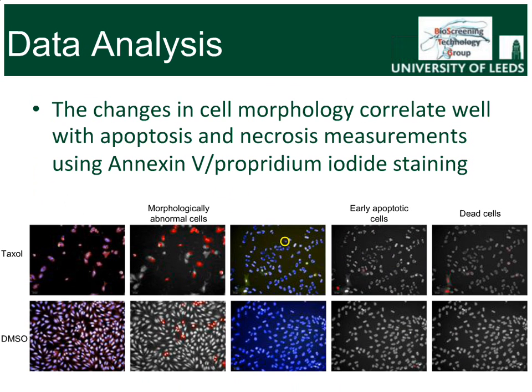Not all the abnormal cells would show up as apoptotic or necrotic, as shown by the cells ringed in the yellow circle, indicating the analysis package developed can identify subtle and prelethal changes to cell morphology, a valuable asset compared to cytotoxicity assessments based purely on cell counts.